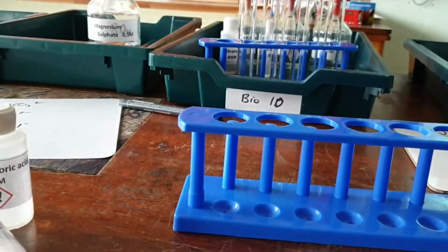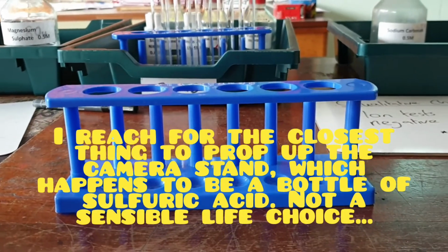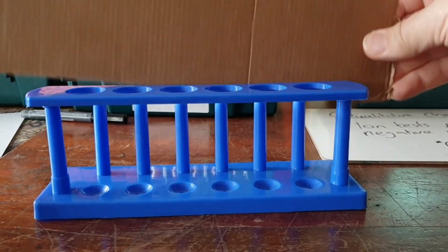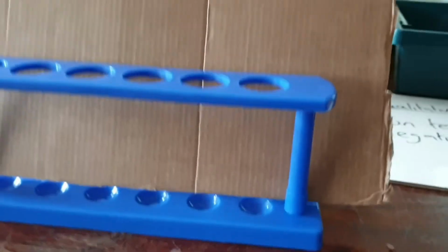Where are we? This isn't going to work, is it? Come on, don't let me down. Right. Let's add a background so you can see. Let's try and improvise this a little bit more. I'll take this out with the magic of editing.